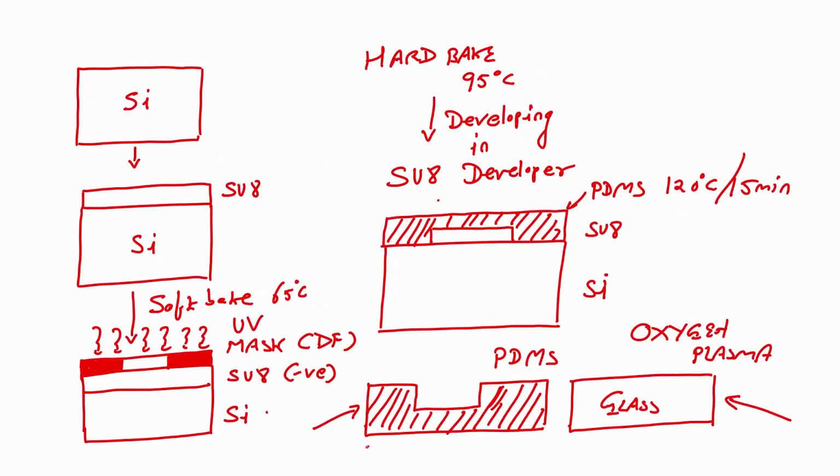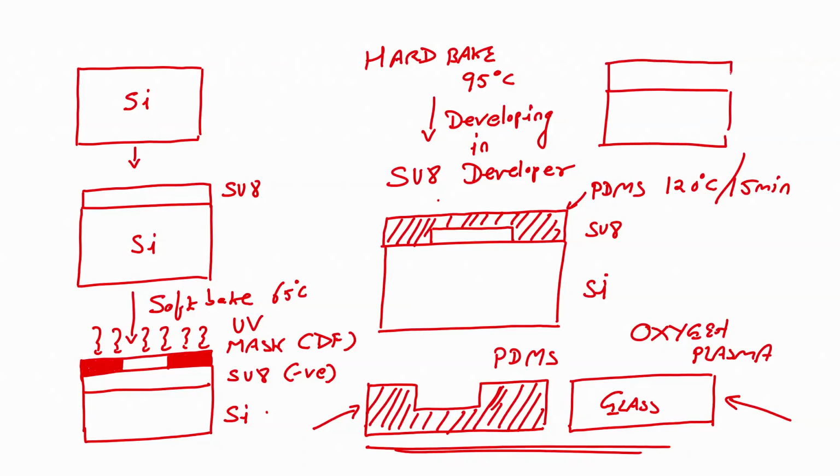Once I perform oxygen plasma, I will bond glass and PDMS.